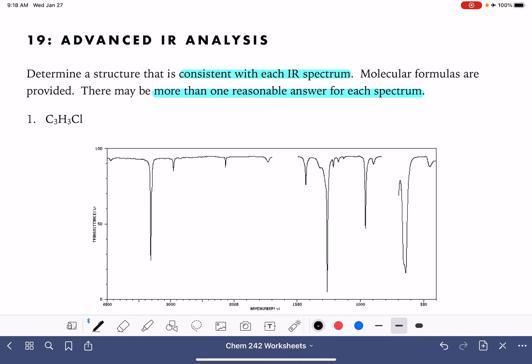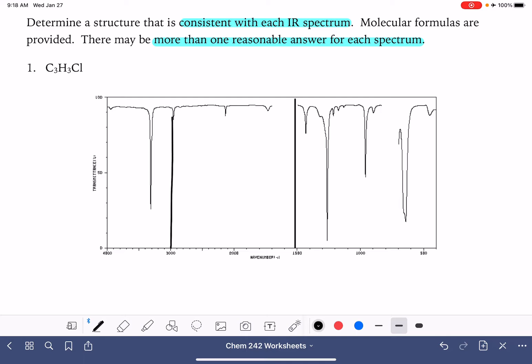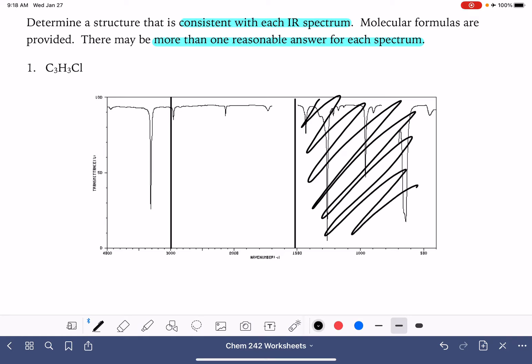Let's start with our first problem. Our formula is C3H3Cl. We're going to begin by drawing lines at 1500 and also at 3000. We want to ignore everything on the right side of the 1500 line. We do want to pay attention to things to the left of the 3000 line. There's a sharp, spiky, strong peak, which is usually an indication of a carbon-hydrogen bond at the end of a triple bond — a carbon-carbon triple bond.